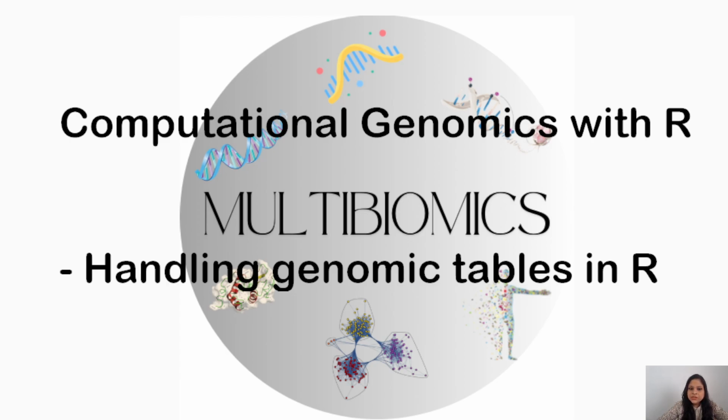By the end of this session, you'll know how to install both CRAN and Bioconductor packages, read and write genomic tables efficiently, save and reload R objects safely, and handle genomic-specific formats like BED files using the rtracklayer package.